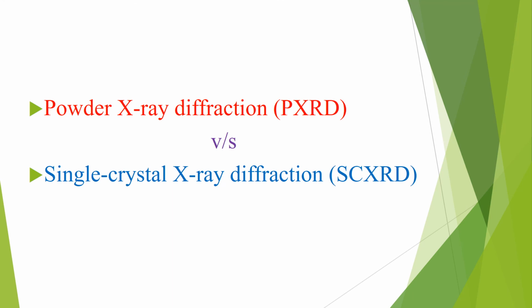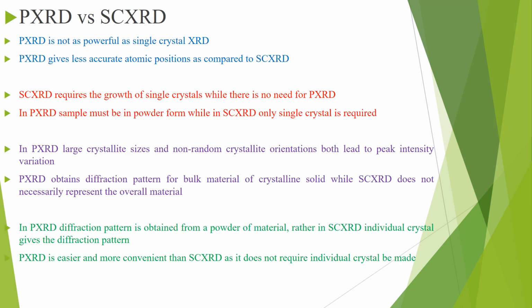Here is some comparison between powder X-ray diffraction, PXRD, versus single crystal X-ray diffraction, SCXRD. Dear student, here we are going to compare PXRD and SCXRD, powder X-ray diffraction technique and single crystal X-ray diffraction technique.